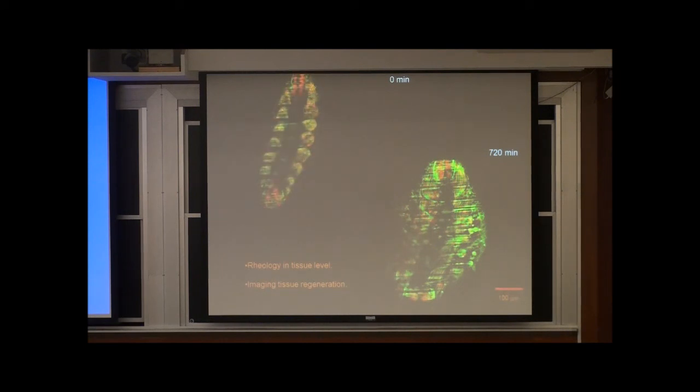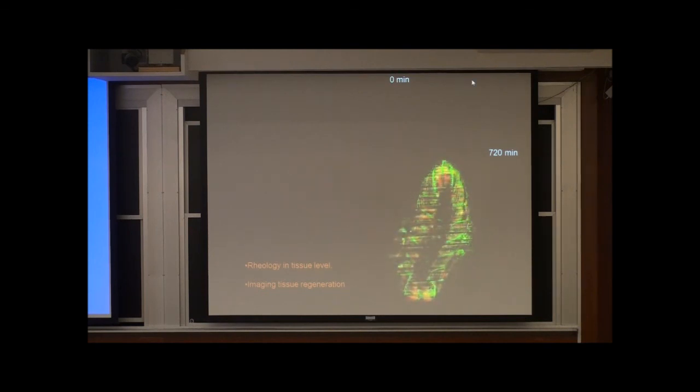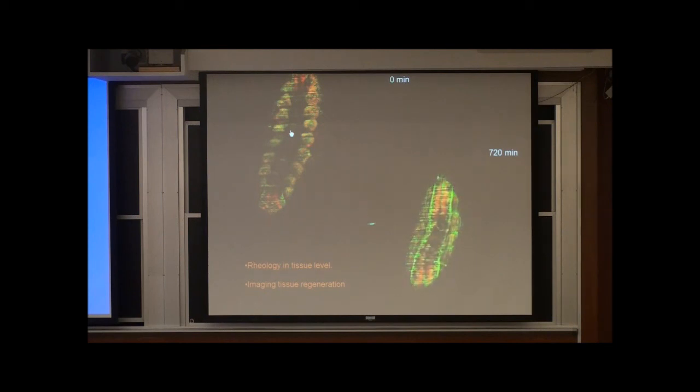Similarly, we can go in from this point. Once we go to the later stage, you can see here the muscle tissue formation after around 12 hours.